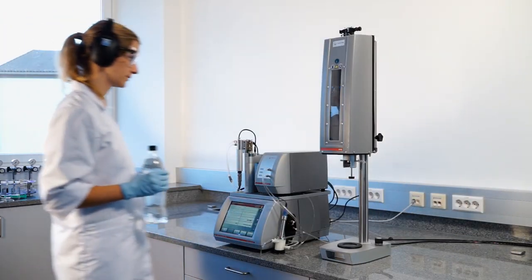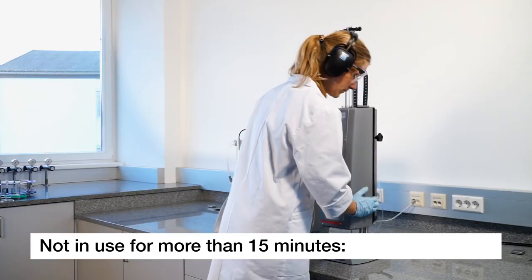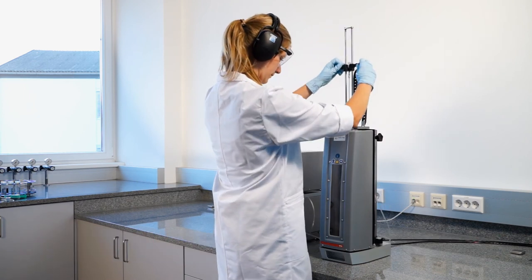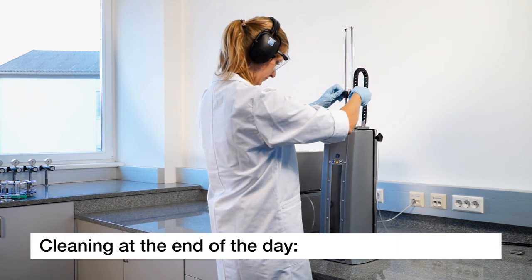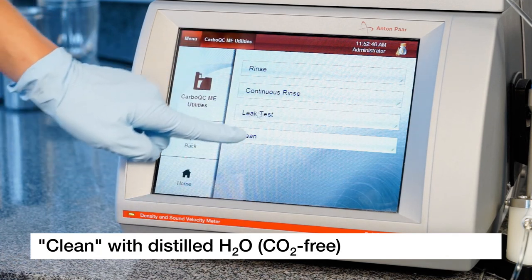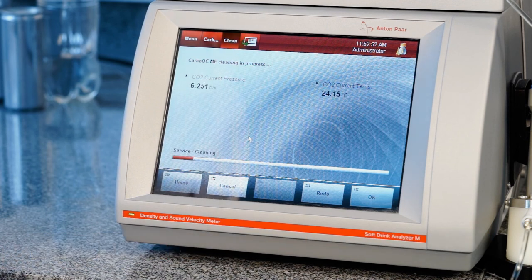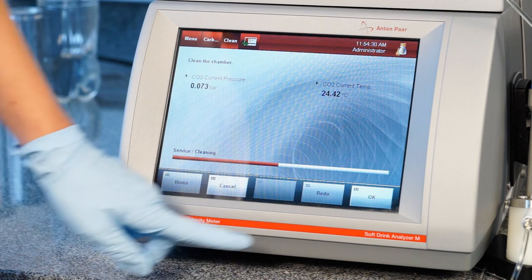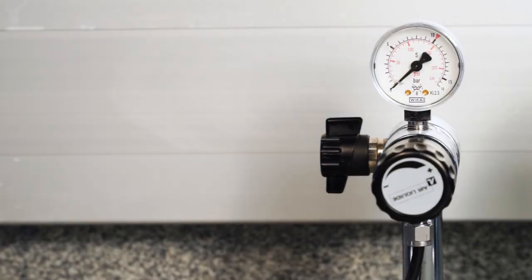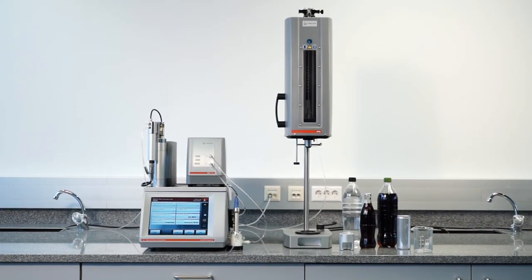In case you are not using your PBA system for more than 15 minutes, please fill distilled CO2-free water, either by starting a measurement or by the utility called Rinse. For daily cleaning, insert a bottle of distilled CO2-free water instead of your sample. Select Clean to start the automatic process. After about two to three minutes, stop the process again. In case the analysis is stopped overnight for any reason, deactivate the pressure. Now the PBA system is clean and ready for the next measuring cycle.